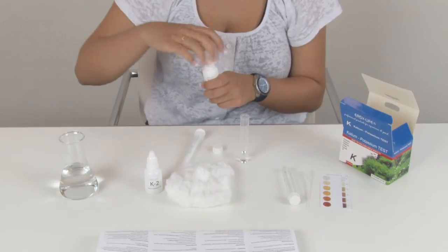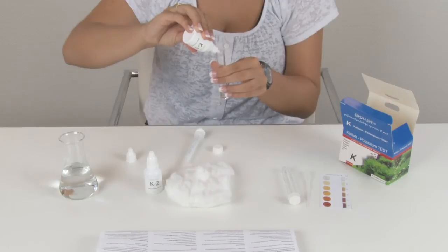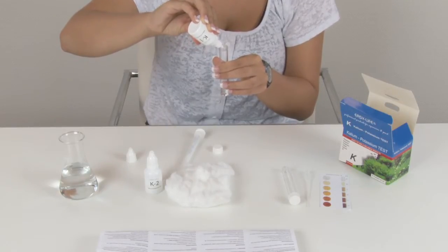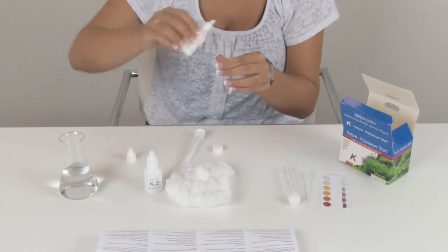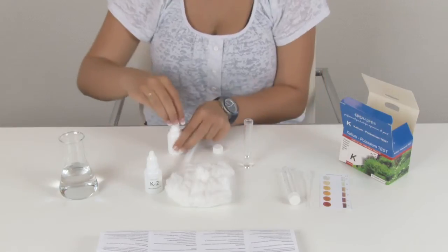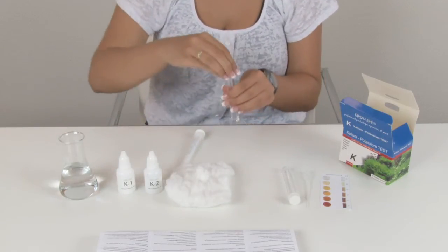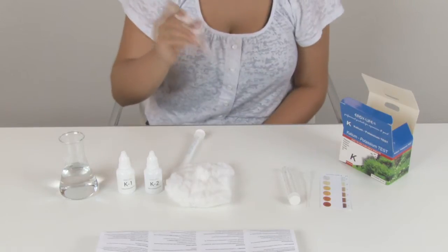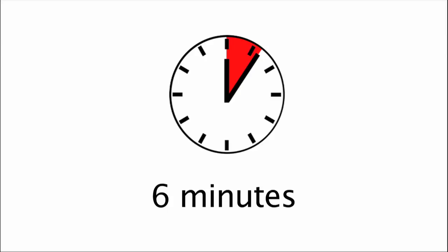Shake first and add now 10 drops of reagent K1 under a 45 degree angle. Cap the test tube and mix firmly for about 30 seconds. Wait for 6 minutes before proceeding.